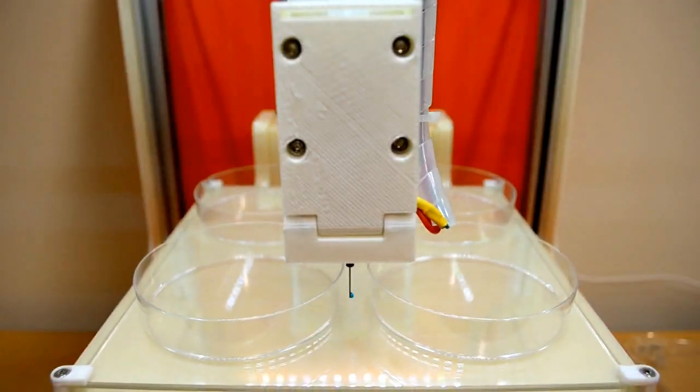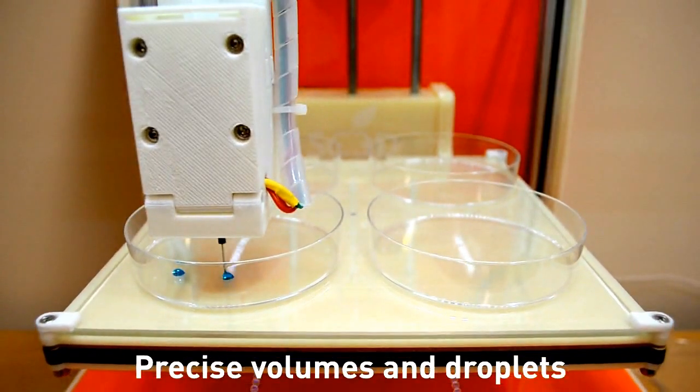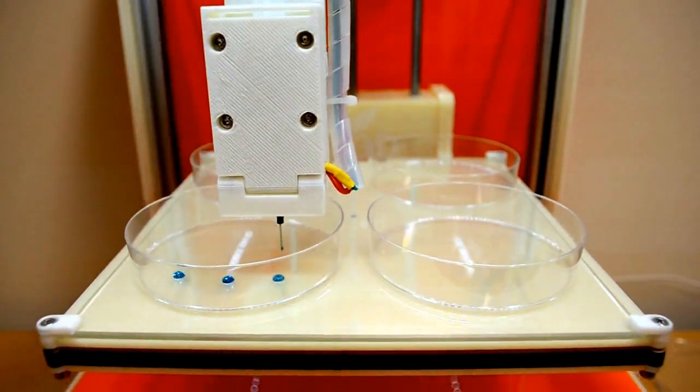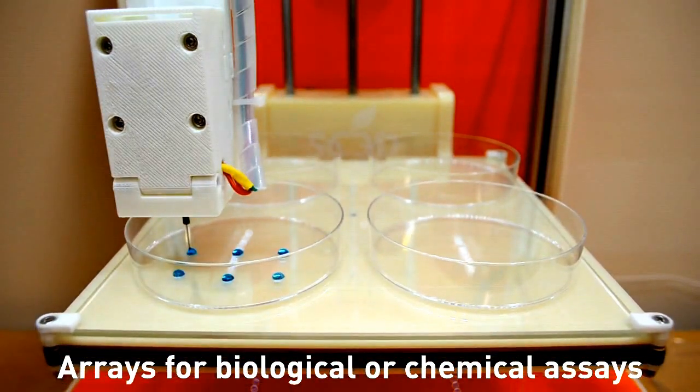With the REBEL bioprinter, students can generate precise volume and droplets of fluids in an array format to create biological or chemical assays.